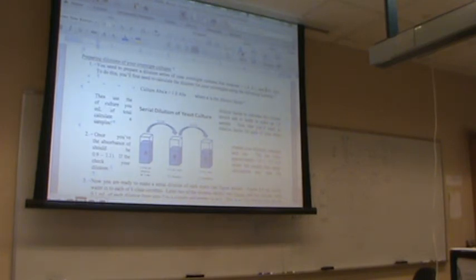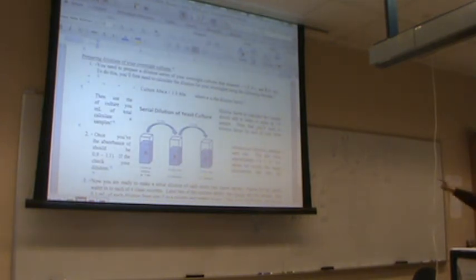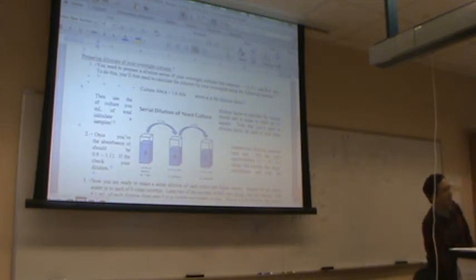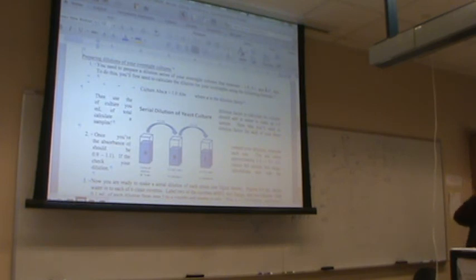And then you do from there the 10-fold dilution, 10-fold dilution, 10-fold dilution. Yeah, you should have nine tubes in front of you, all labeled.